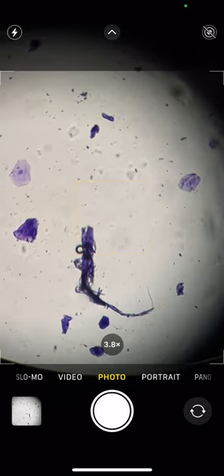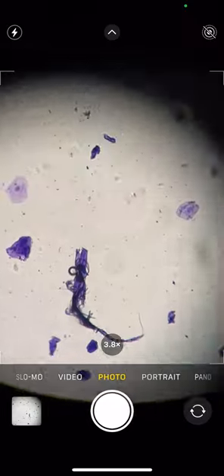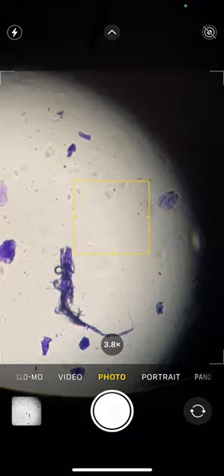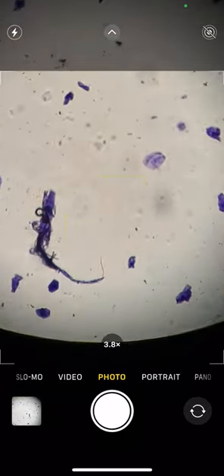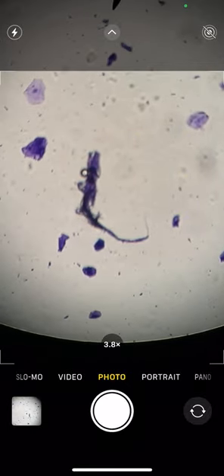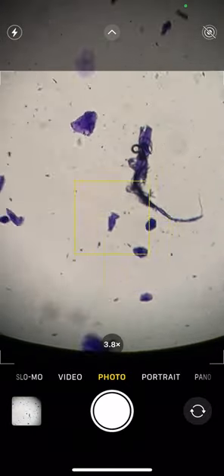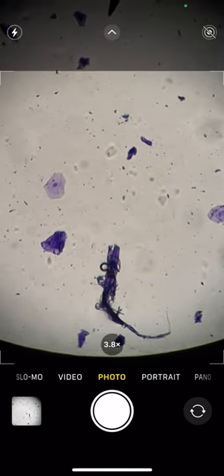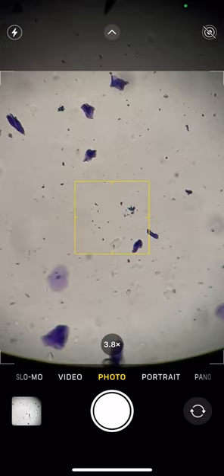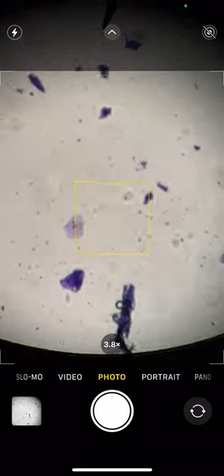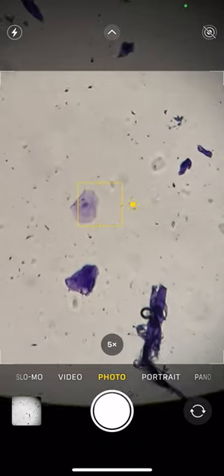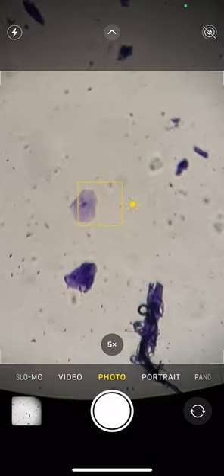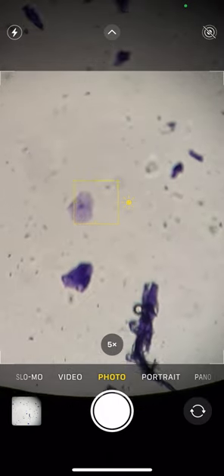You notice that thread or fibrous whatever. My phone is sliding. I was using that as a marker for that rather nice looking cell right above and to the left of it. Yep, that went right there. It's got a very nice nucleus in the middle of it.